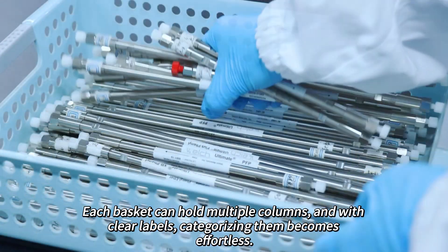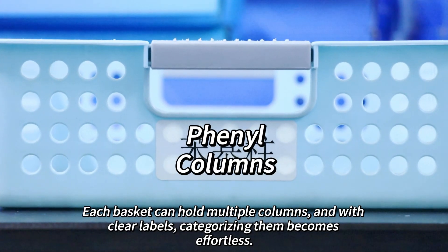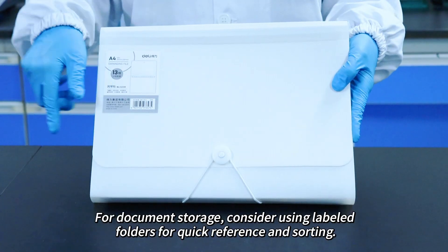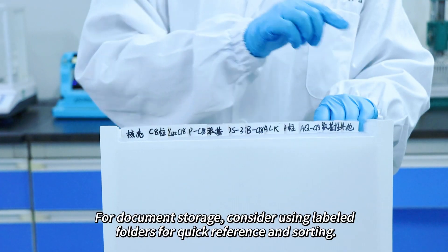Each basket can hold multiple columns, and with clear labels, categorizing them becomes effortless. This approach not only enhances organization but also maximizes storage space for columns. For document storage, consider using labeled folders for quick reference and sorting.